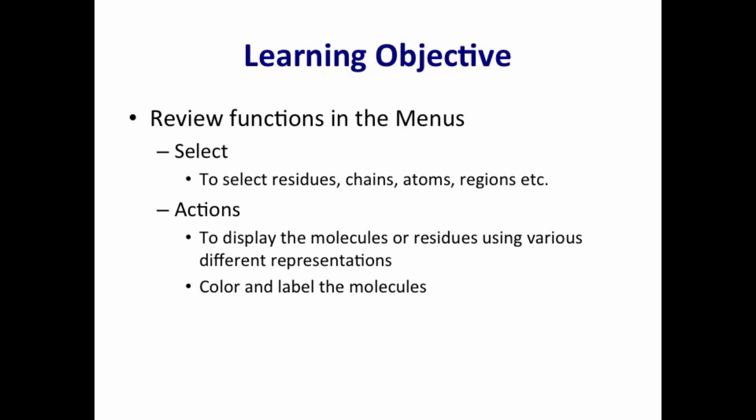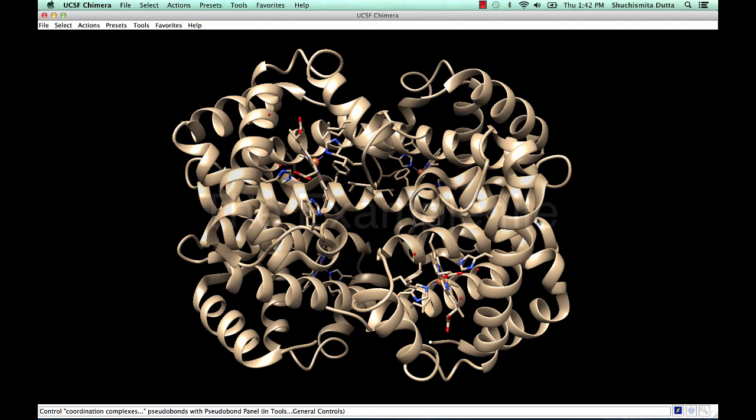In the Select menu, you will learn to select residues, chains, atoms, regions, etc. Using the Actions menu, you will learn to display the molecules or residues using various different representations. You will also learn to color and label the molecules.